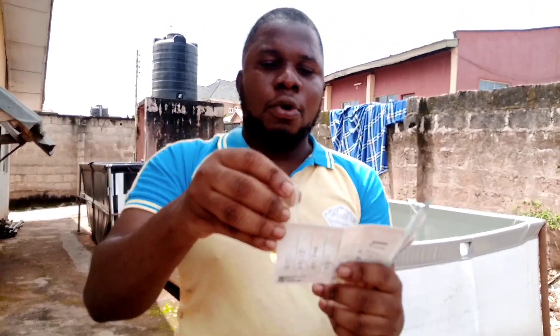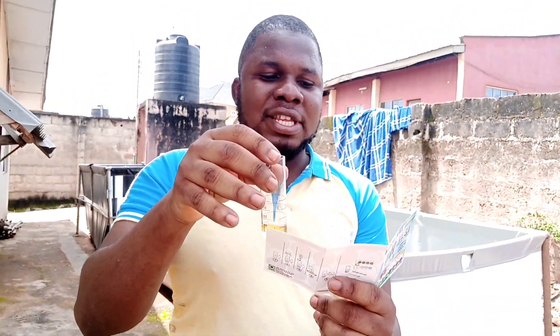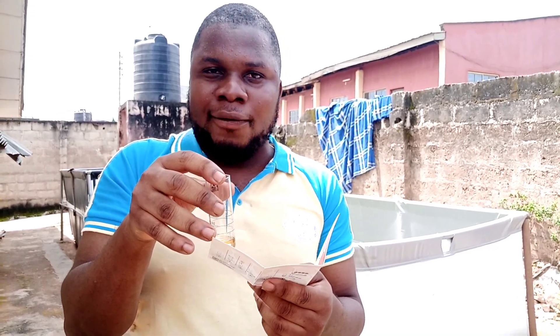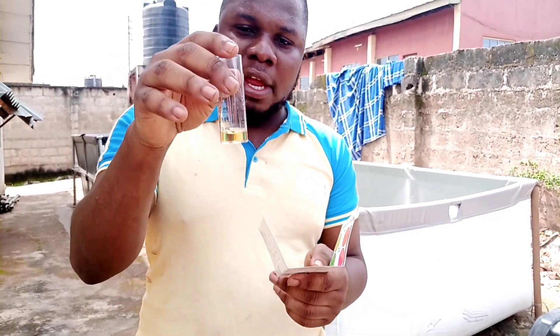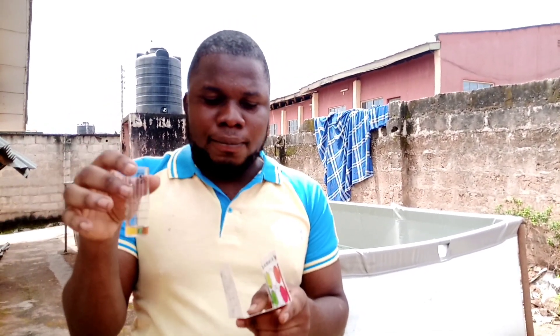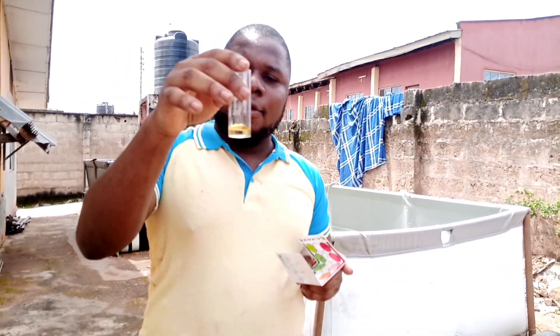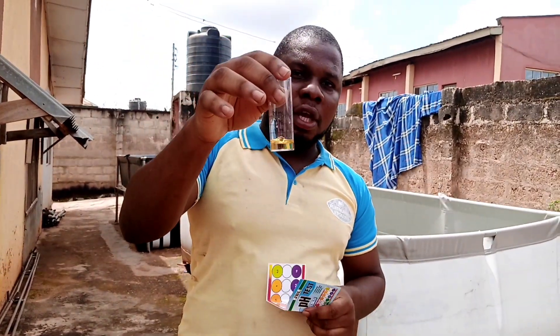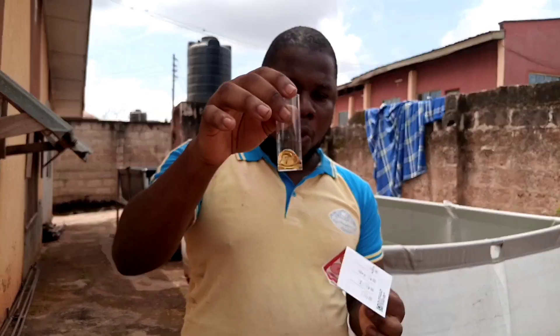So for neutral, the major number is 7. However, the acceptable range is from 6 to 7.5 or 8. If you have any result within any of these colors, you are still good. The neutral number is 7, so 6.5 to 7 to 8 is still reasonable for a neutral result. This is how to test the water pH of your water.